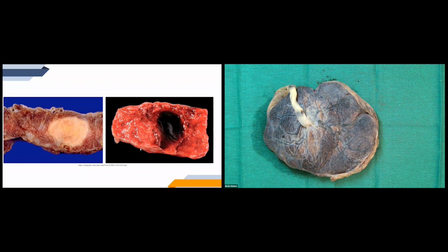So it is really important, like I mentioned, that we want to document the percentage of these infarcts and as well where their location primarily is.